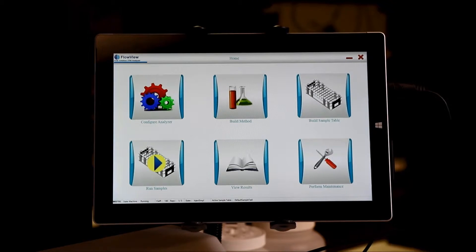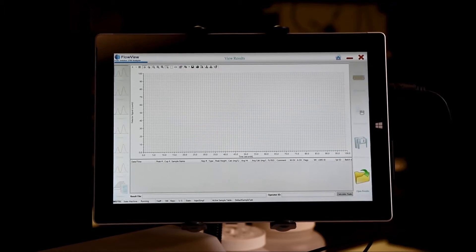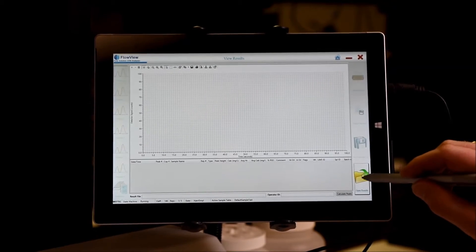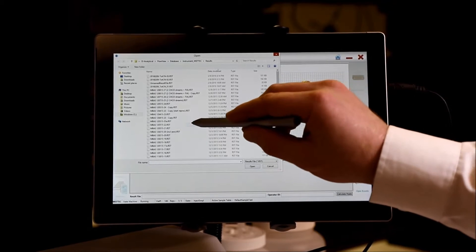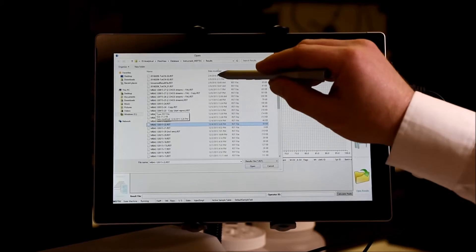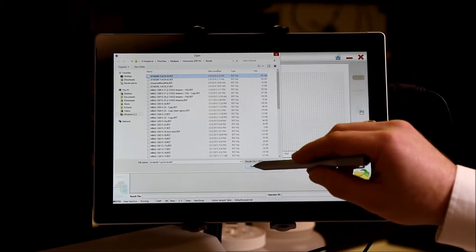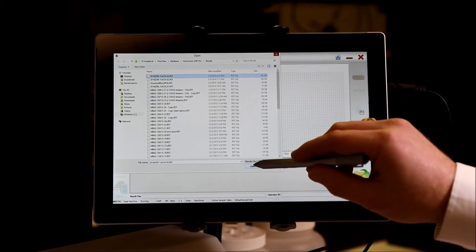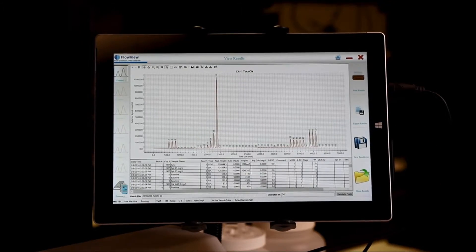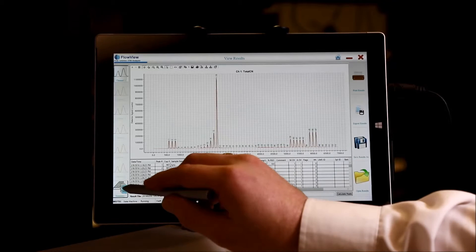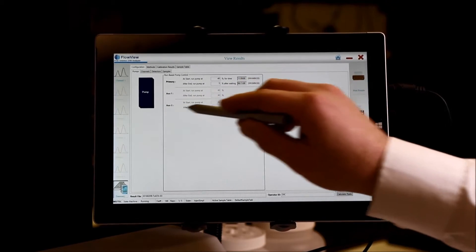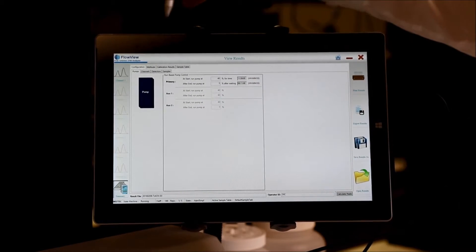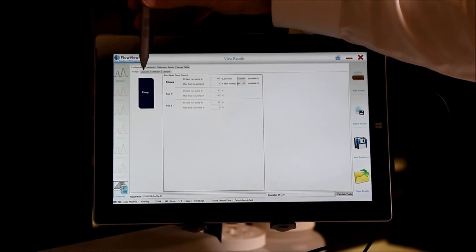So from the home screen, you can choose view results and take a look at any previous data that's been collected, or even the data that's currently being collected in real time. So from here, we can take a look at all of the parameters that were used to collect this data.